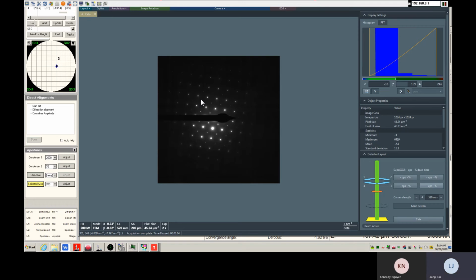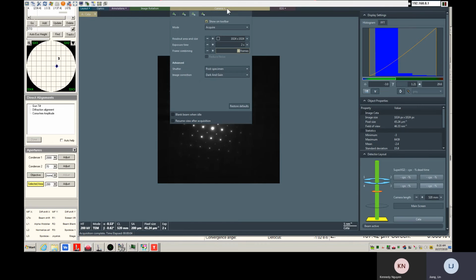That's the first thing. You need to get a good focusing. You need to select the region. The second thing, you need to determine what kind of exposure and intensity you will use. In this case, you can better protect your camera. Also, you can have a good signal to noise ratio. So you go for lowest 1K by 1K imaging and go for lowest exposure time.